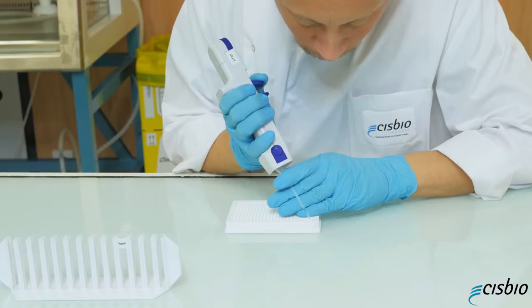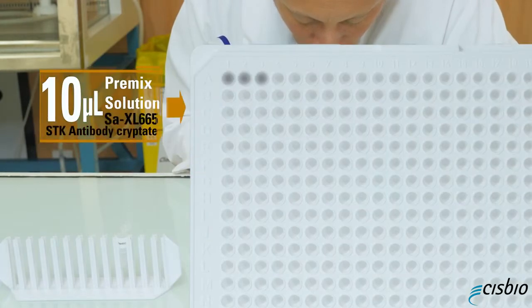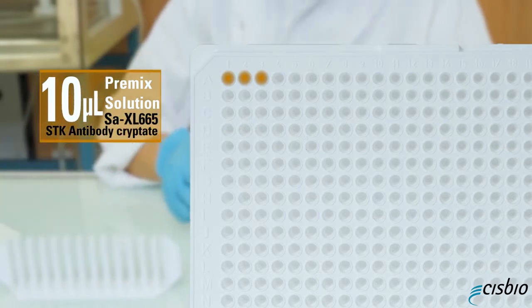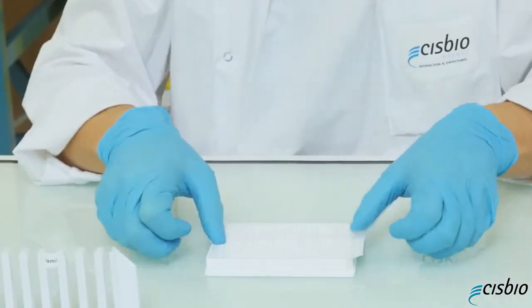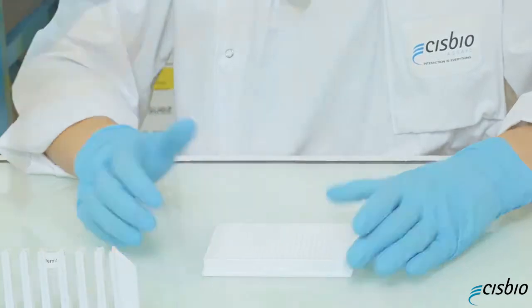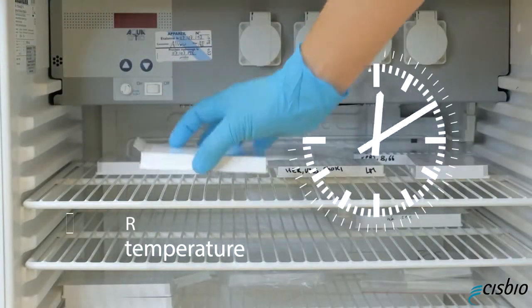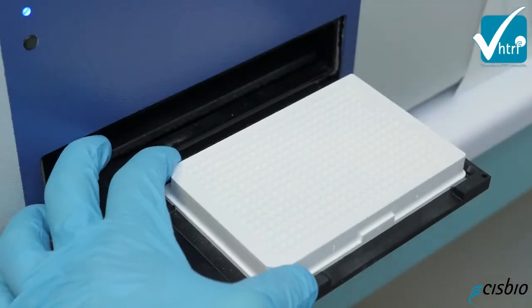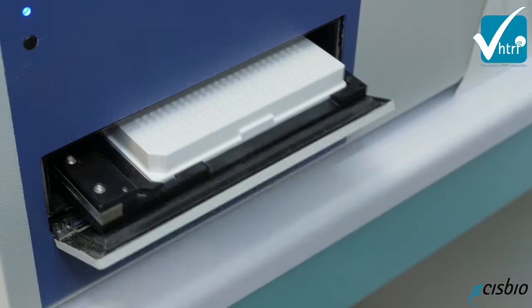Remove the sealer and add 10 microliters of pre-mixed solution of SAXL665 and STK antibody cryptate for the detection step. Seal your plate and incubate it again for one hour at room temperature. Then remove the plate sealer and read on an HTRF-compatible reader.